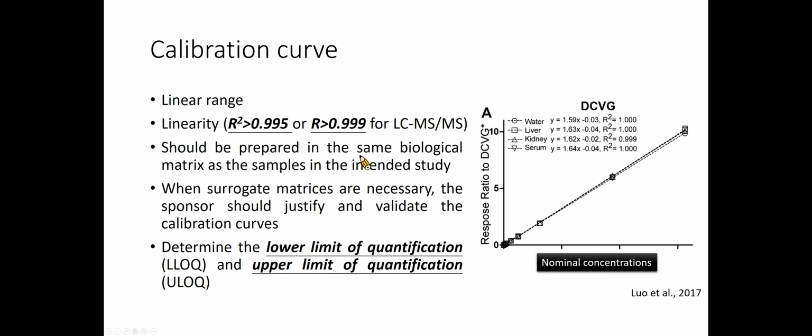During the method development, you should choose the quantitation range of the assay and the concentrations of the calibration standards on the basis of the concentration range expected in a particular study. You should use the simplest model that adequately describes the concentration response relationship, as well as an appropriate weighting scheme and regression equation.